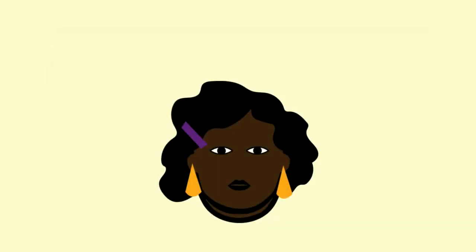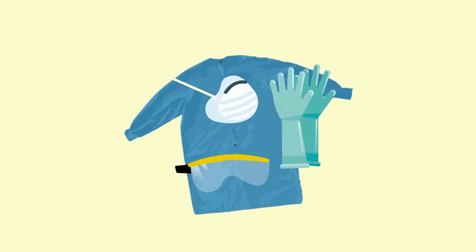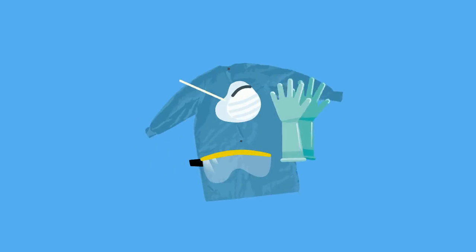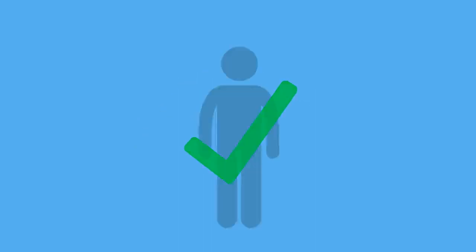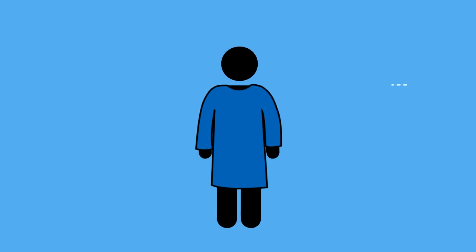To begin dressing, ensure you remove all jewelry and personal items and that long hair is tied back. Make sure you are using appropriate PPE for the precautions needed. Step one is to perform hand hygiene. Then ensure the PPE is not damaged. Put on the gown first — tie around the neck and around the waist and secure it around the back.